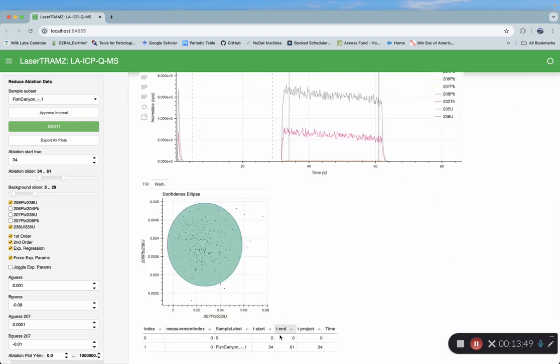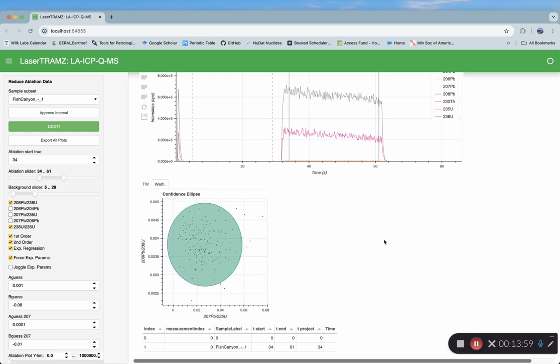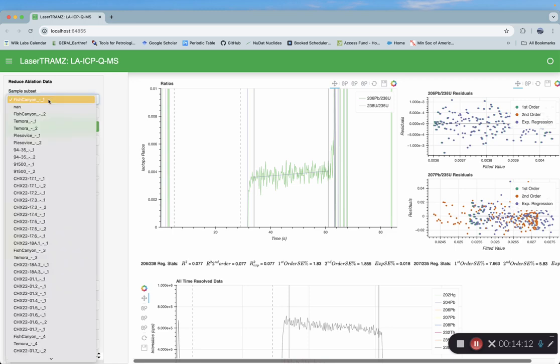Okay, scroll down, there it is. So here's a bunch of ratios. I described these in the GitHub page, what they all mean, but there they are. Okay, so I'm just going to select a few of these and output the data so that you can see that, and we'll import that data into the second part. Hopefully I can speed up this video.